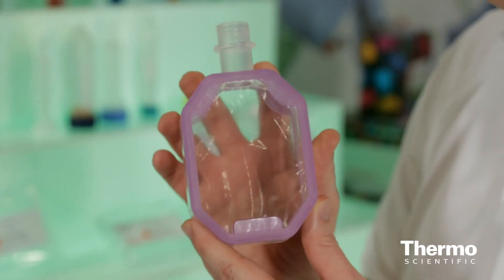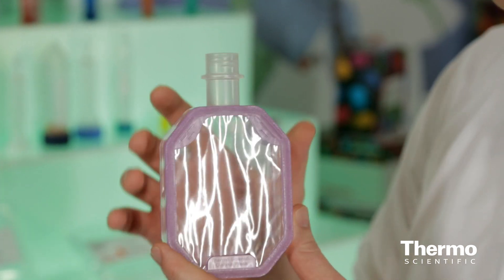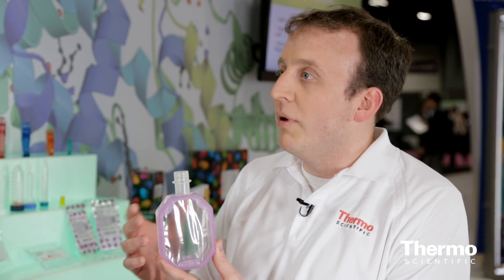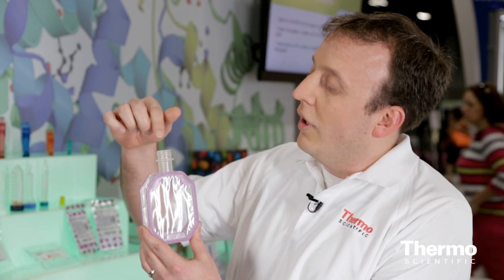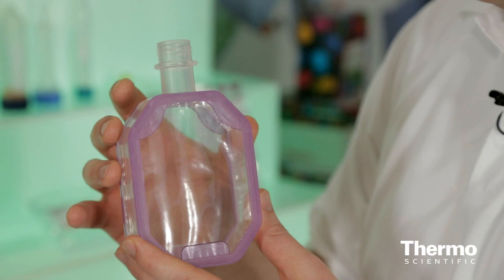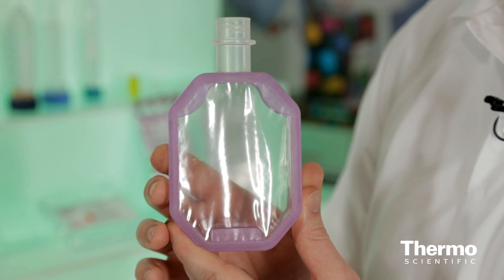This is our new slide-alyzer flask. The flask is able to hold 250 mil volume, and just like our other slide-alyzers, it's a dialysis unit that's very convenient and very efficient at removing contaminants and changing the buffer. All you simply do is fill your sample into the top here, and you submerse it into the buffer that you want to change it into. This usually is an overnight experiment or protocol, but once you do, you have the sample in the right buffer and it's ready to go for your downstream application.